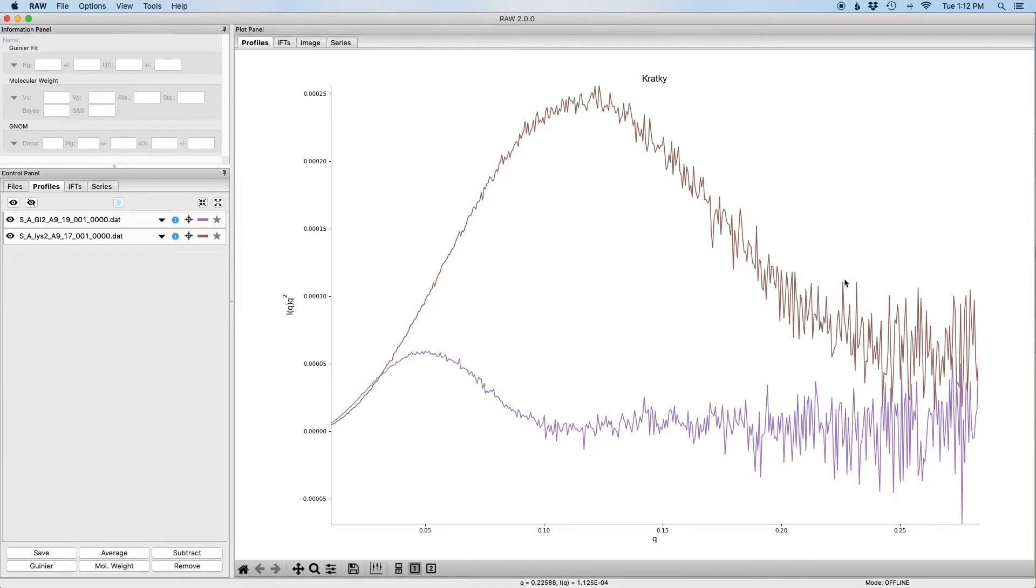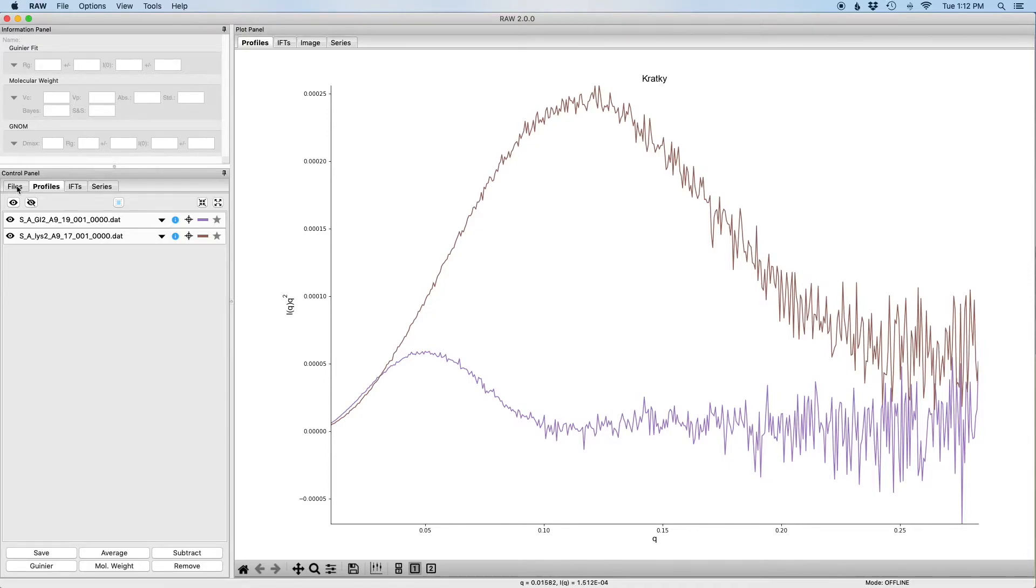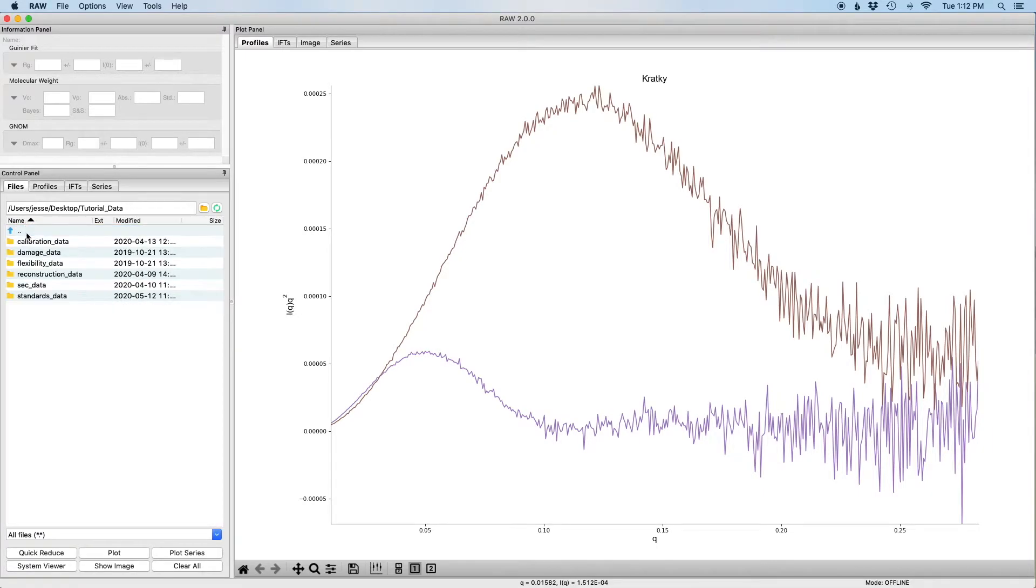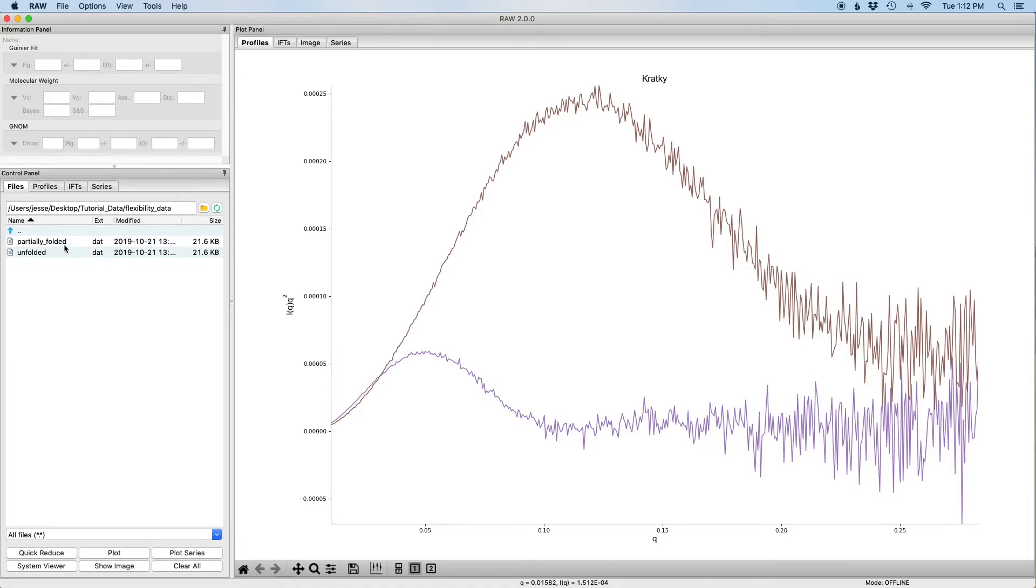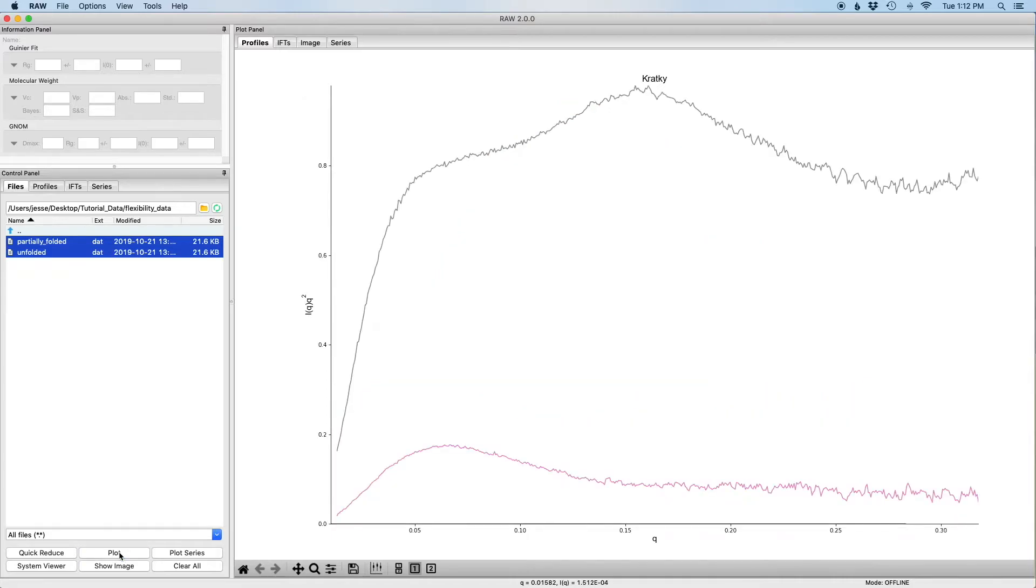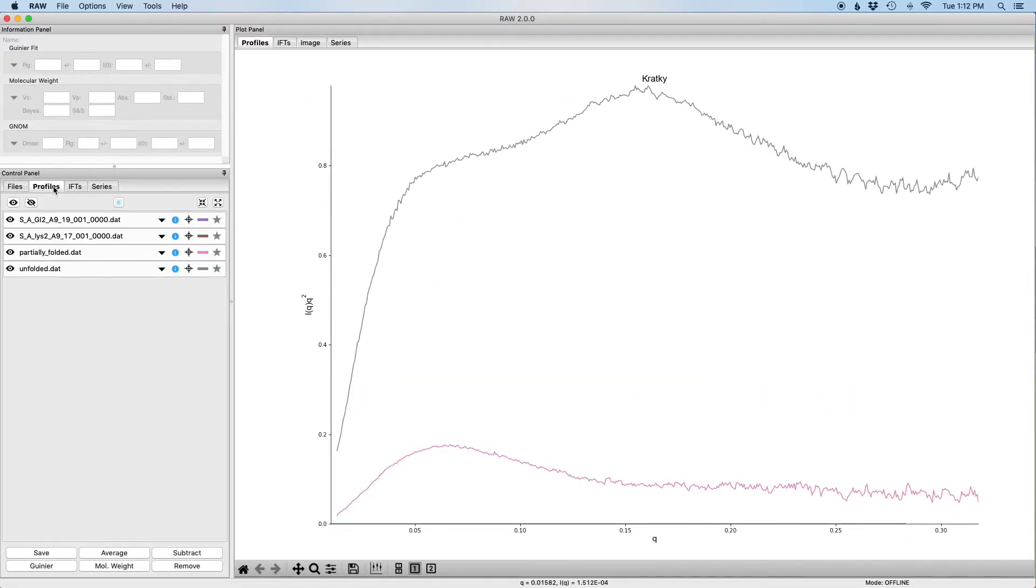So what we're going to do now is we're going to load two additional data sets. So I'm going to go to the files tab. I'm going to go up a level. I'm going to go to the flexibility data and I'm going to load both the partially folded and unfolded data files.